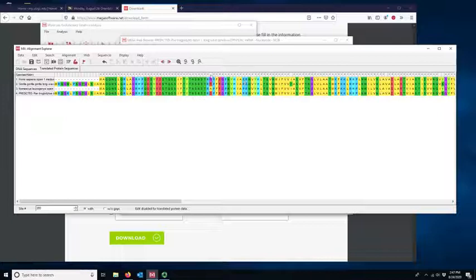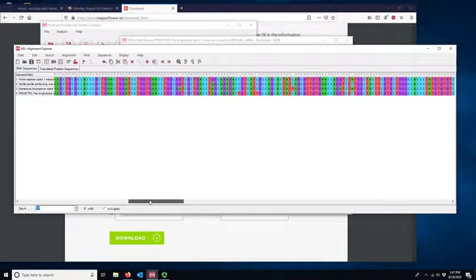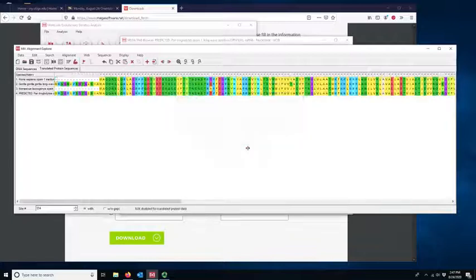Okay, but notice there are polymorphisms. So there are sites where amino acids are variable. And if we look at the DNA sequence, we're going to see even more polymorphisms with more changes at the DNA level. Not all changes at the DNA level lead to a change at the amino acid level. So for instance, here we have one that I would bet that when we translate it, yep, there it is, everything is the same, okay?